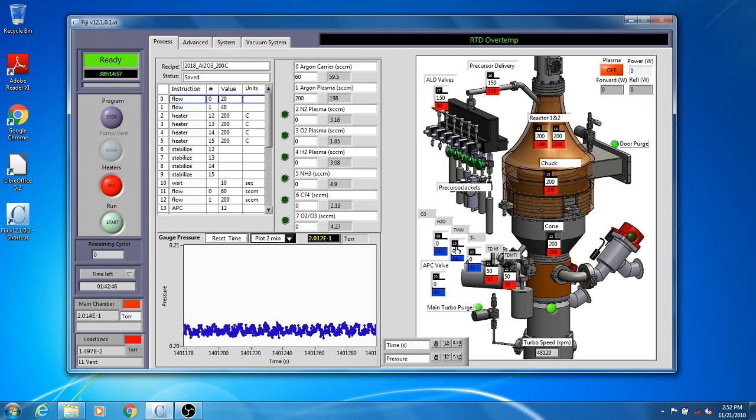The third one was silicon, but at this point it is changed to platinum, which works at 80 C and is kept at 80 C. Hafnium and titanium work at 75 C, but are kept at 50 C when not in use. To change the temperature of the precursor, write the value of the required temperature in the white boxes on top of the red or blue boxes.